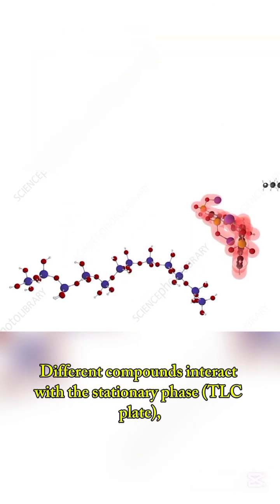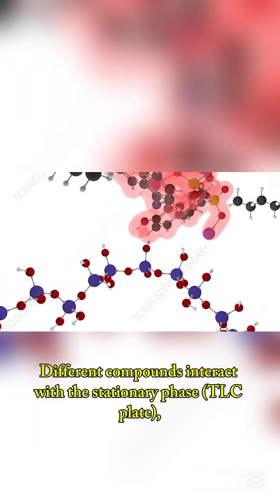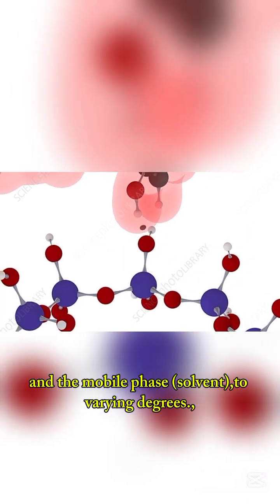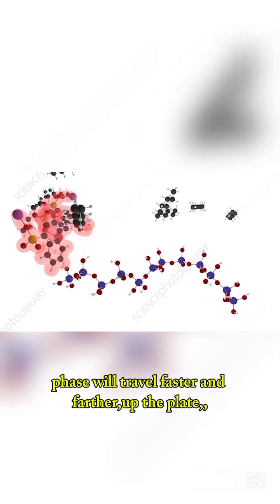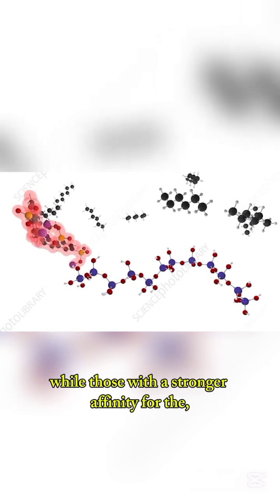Different compounds interact with the stationary phase, TLC plate, and the mobile phase, solvent, to varying degrees. Those with a stronger affinity for the mobile phase will travel faster and farther up the plate, while those with a stronger affinity for the stationary phase will travel slower and shorter distances.